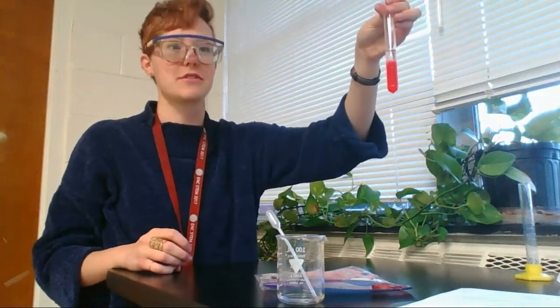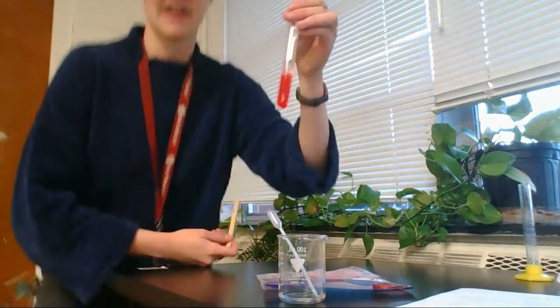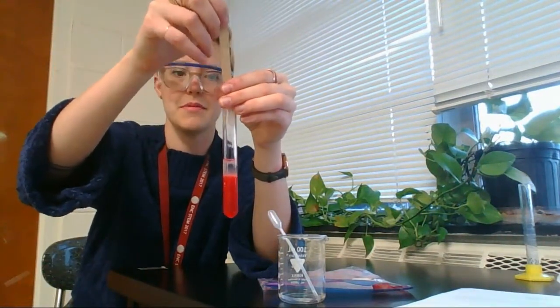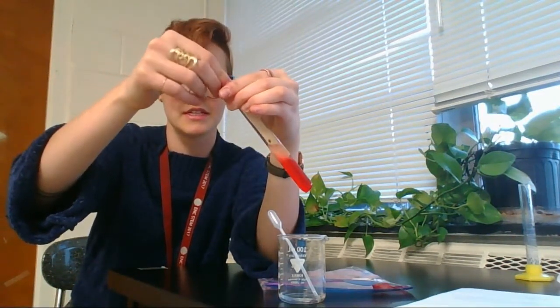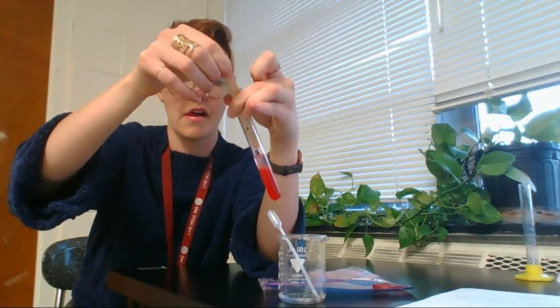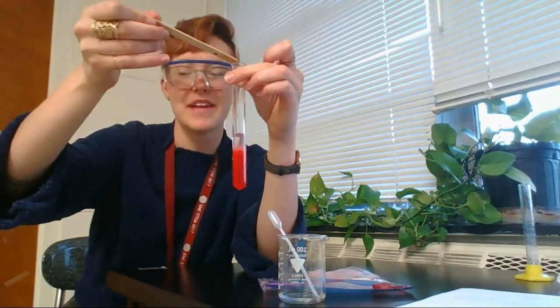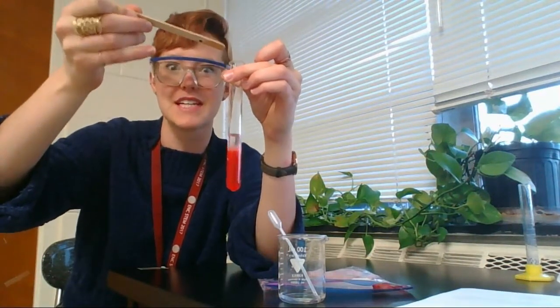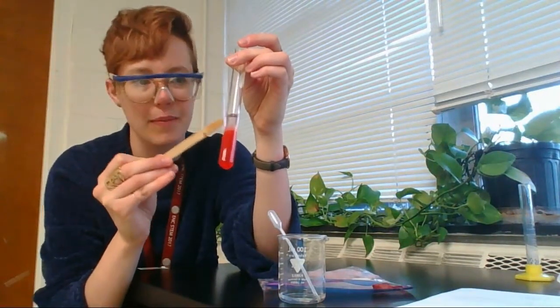I forgot to get my popsicle stick, let me get my popsicle stick. What I'm going to do is I'm going to take my popsicle stick, put it in my test tube, and I'm going to pull out some of my DNA. You might kind of have to twist it to the side. And you can get some of the snot. It looks like snot, but that's actually strawberry DNA. We crushed up the millions of cells inside that one strawberry, and this is all of the DNA from that strawberry.